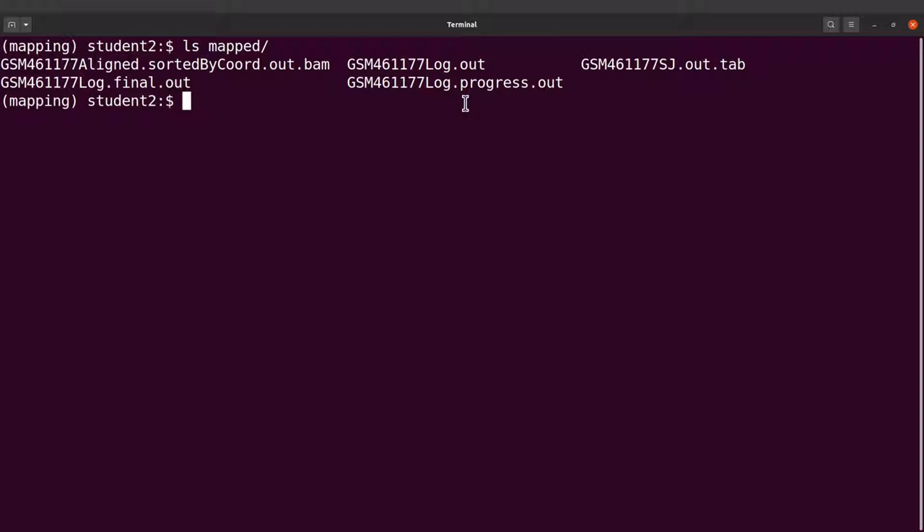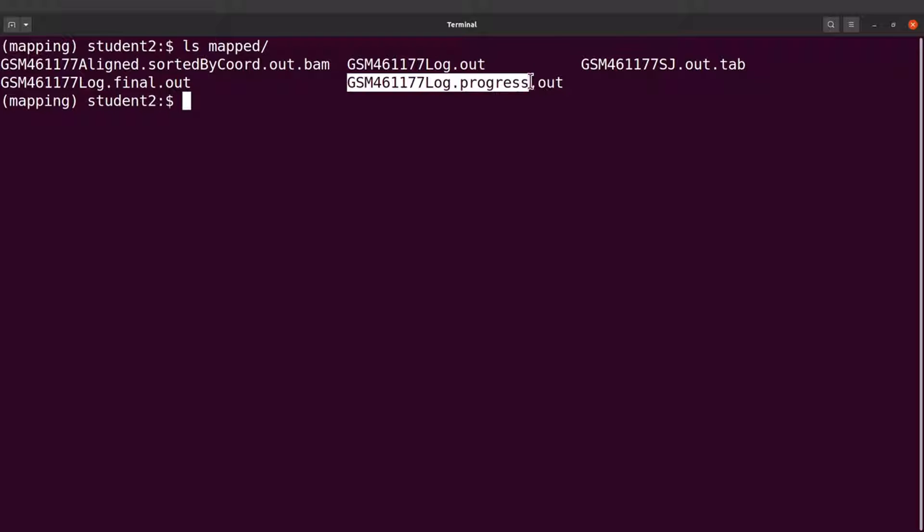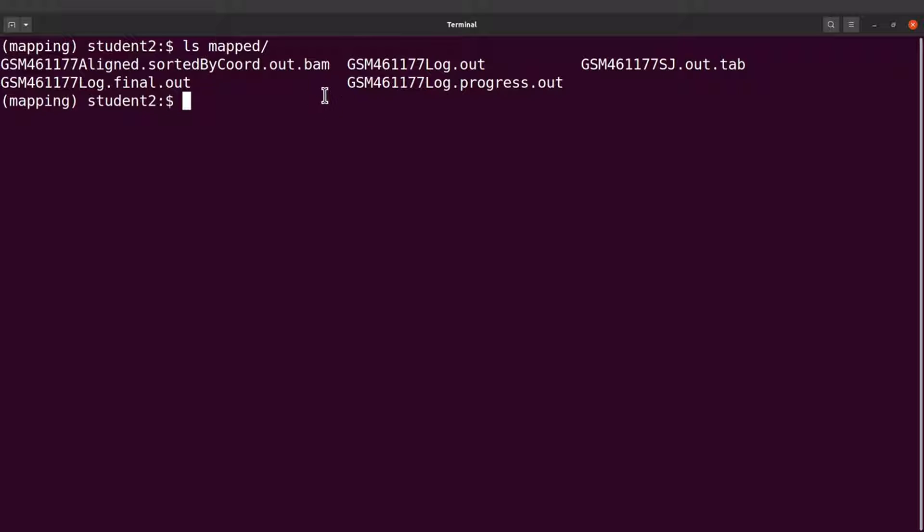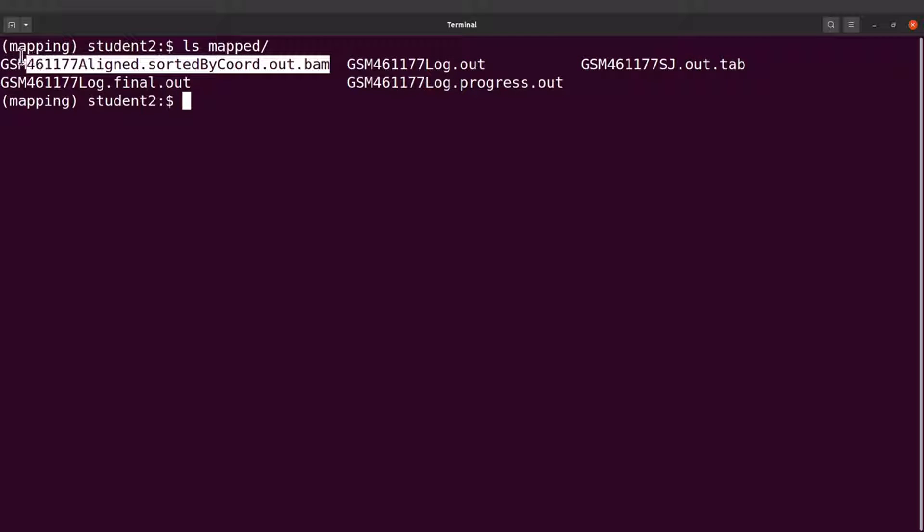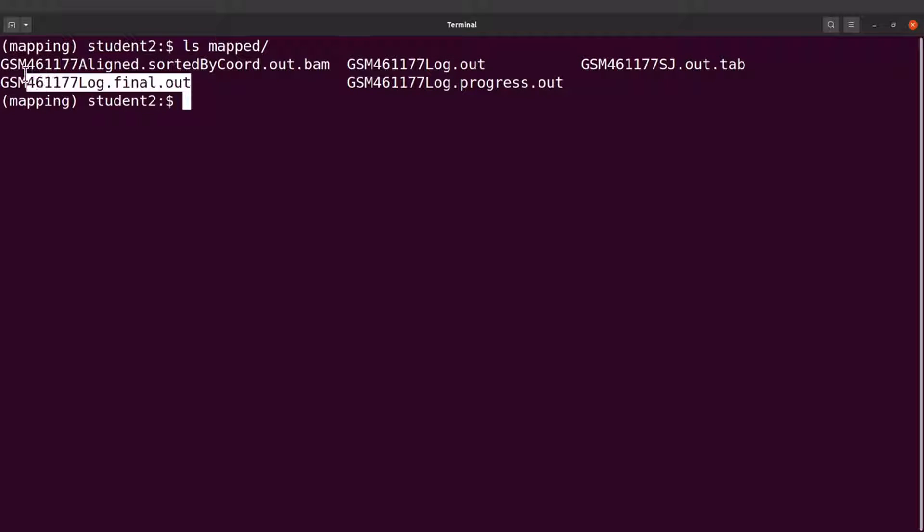It writes the progress of whatever mapping activity it's doing at that time. So in an interval of one minute, that is every one minute, STAR generates a progress report and the report is stored or saved in this file. With the file output, I'll focus on the BAM file and then the mapping statistics log file.